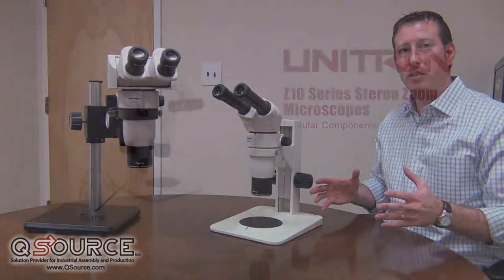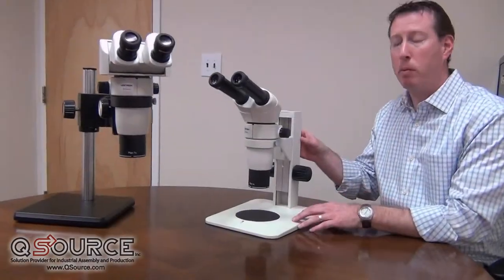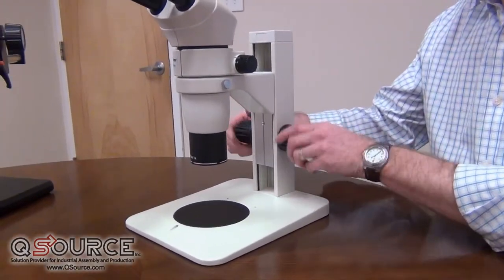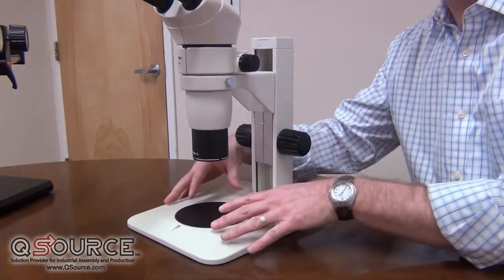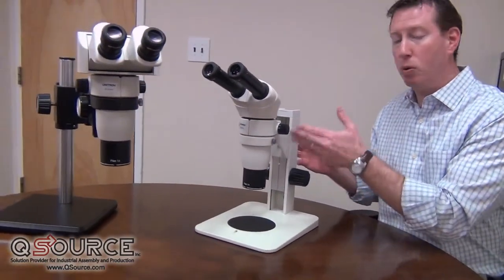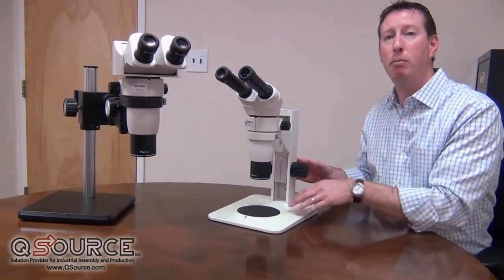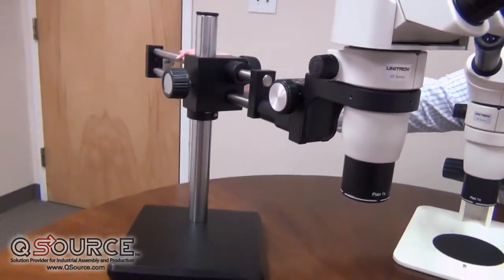The final choice is the stand option. The stands are all sold separately, but here you see an example of a plane focusing stand. You can simply and easily focus up and down to get to the right height — great for specimens that can fit onto the stage plate platform here. Other options include an LED stand, not shown here, which would have top and bottom LED light built into it, or for larger specimens you can work with a ball bearing boom stand.